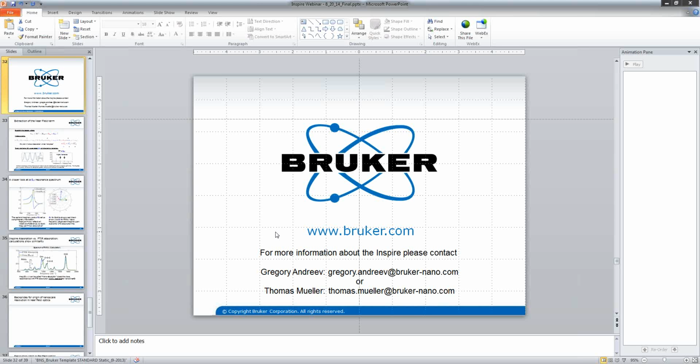I think you answered in passing another question that was on the sample illumination. Is it from above or below? Yeah, it's from above.